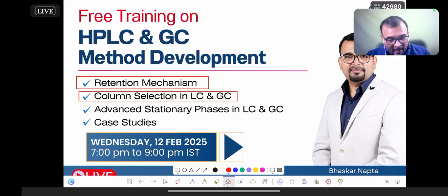So in this webinar we'll also discuss how one can select an appropriate column in liquid chromatography as well as gas chromatography. And finally, we'll talk about some of the advanced stationary phases in both liquid and gas chromatography. When I say advanced stationary phases, I don't mean very niche stationary phases, but the common stationary phases which are widely used across any laboratories. Let us understand those stationary phases in liquid chromatography as well as gas chromatography and understand how these stationary phases retain the compound.